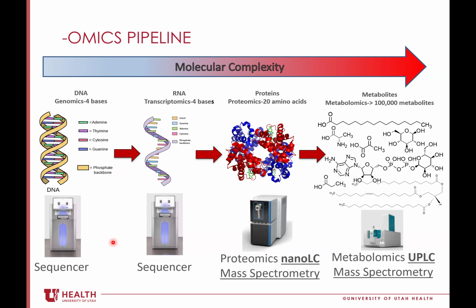And with some types of genomics that we do, we can do a whole genome from a parent and a child in like 3 days, really quick. RNA is the same thing. We really rapidly process RNA data. And now we're coming to proteomics, where just recently there's been a revolution in this field as well. We just did PBMCs like macrophages, and we were able to get 7,000 proteins really easily in a 90-minute run.